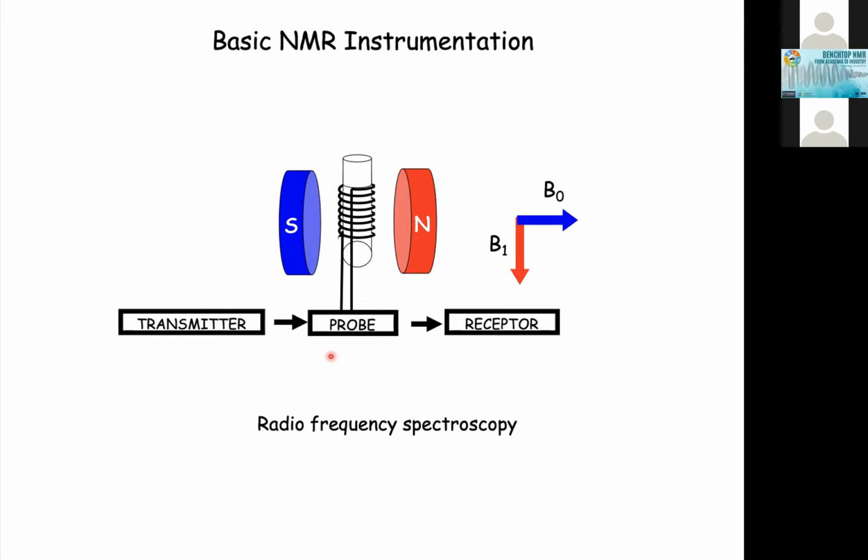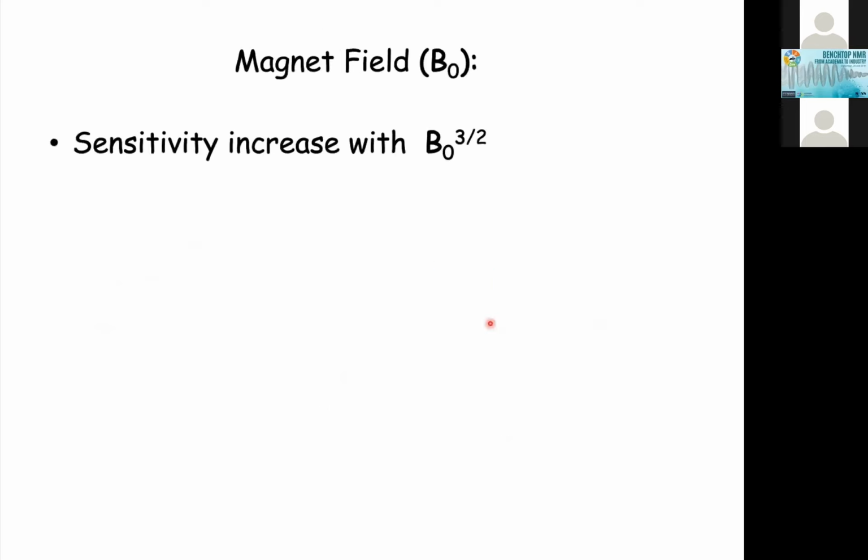has this special characteristic because it needs a magnet in all the electronics. Normally, it's closely related to radio transmission or radio broadcasting, because we have a transmitter like in a radio station and a receiver like the radio that you have in the car and the cell phone now, and we used to have in the house, okay? That's the way that we treat it.